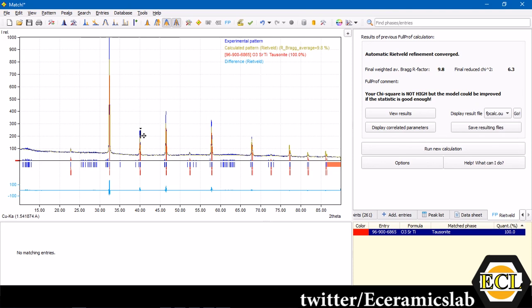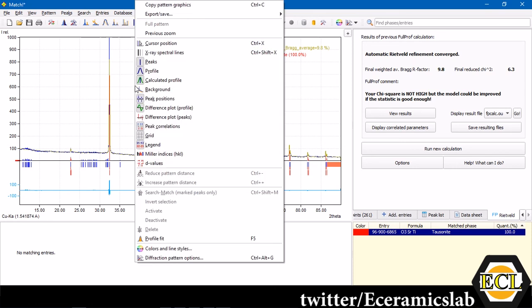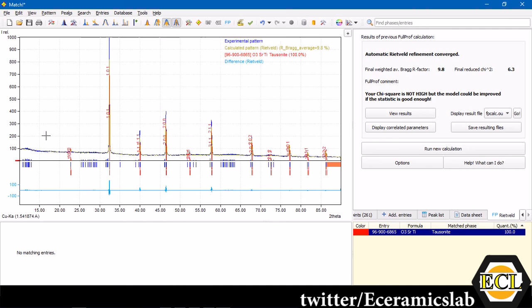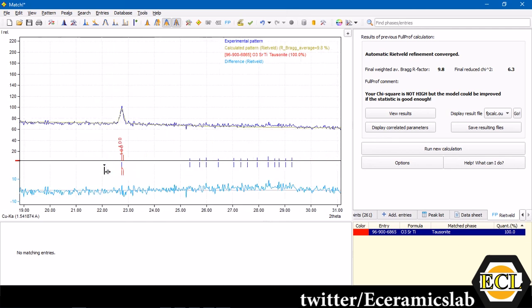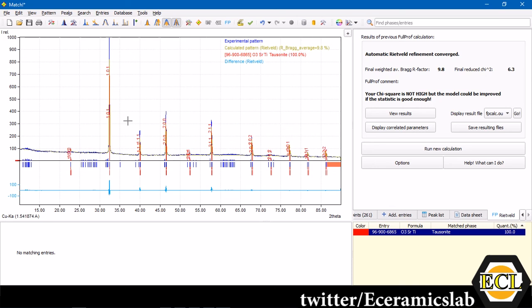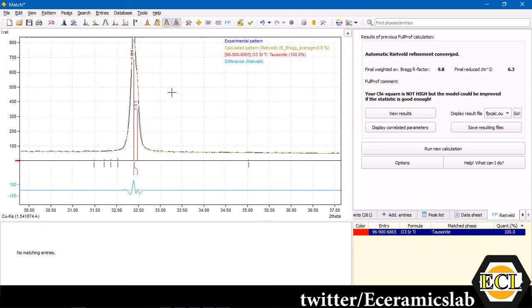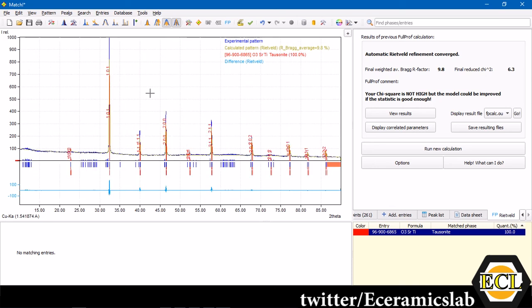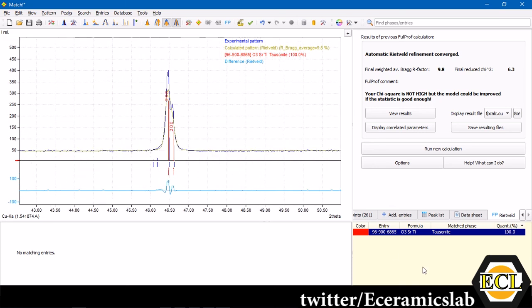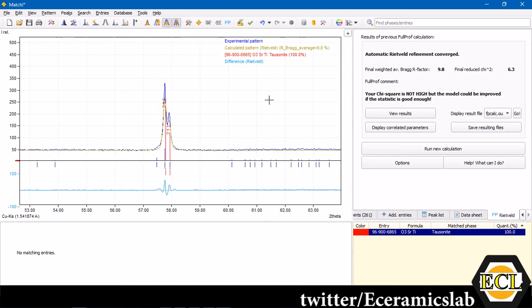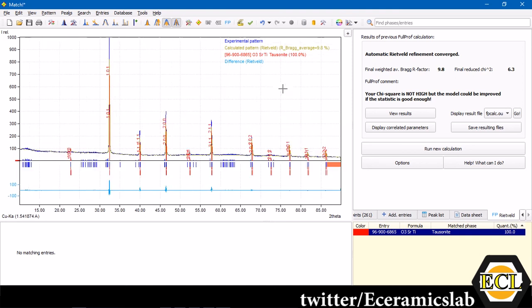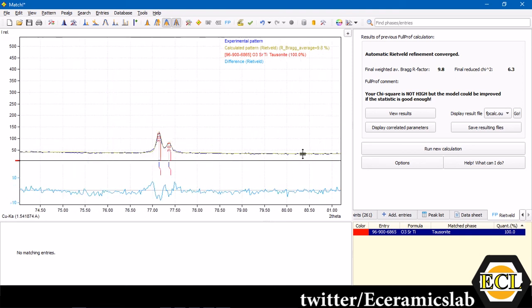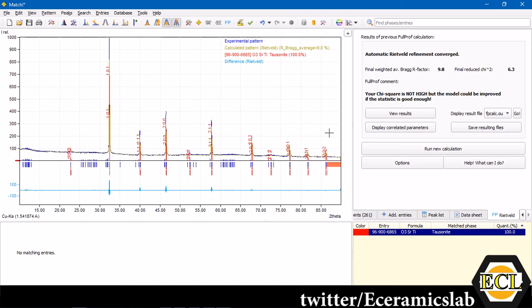If you now want to index the peaks which you have got here using MATCH, then you can just go over there and click hkl, miller indices. Here you can find the matching peaks. This is 1, 0, 0. This is 1, 0, 1. All the peaks have been already indicated. You can save this as well. You can take a snapshot of it or you can index in your graph.